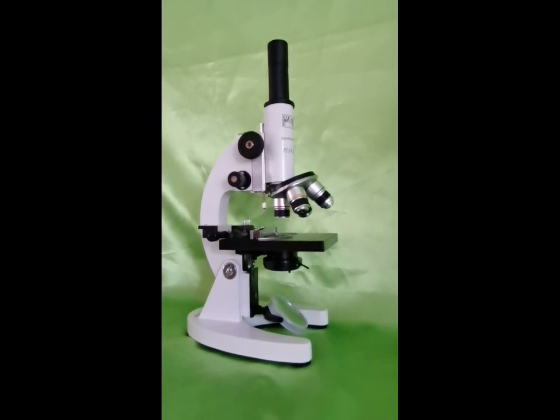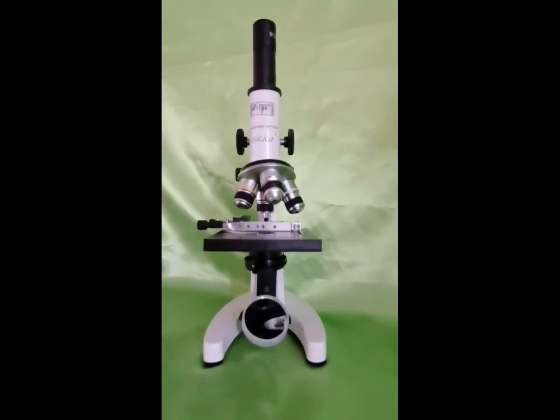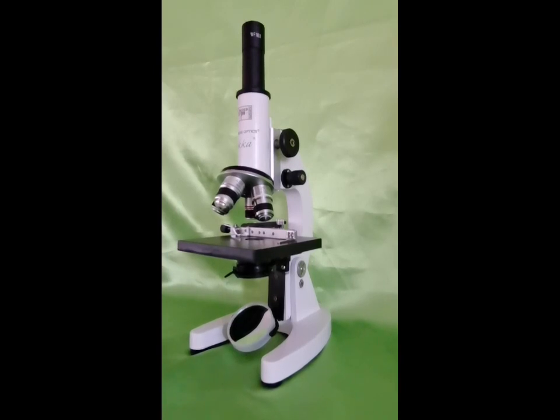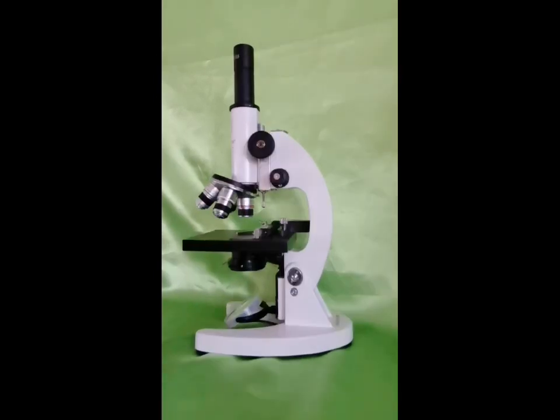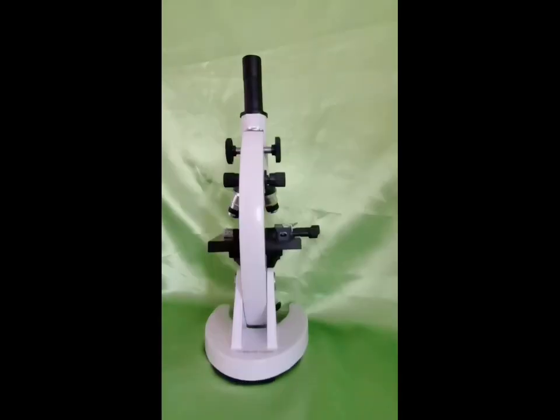There are three major parts of the microscope based on their functions. First is the magnifying parts. These make the specimen look bigger. These parts play the most important role. They include the eyepiece or the ocular and the objectives. Second is the illuminating parts. These parts provide light to the microscope. We have the mirror, condenser, and the iris diaphragm.